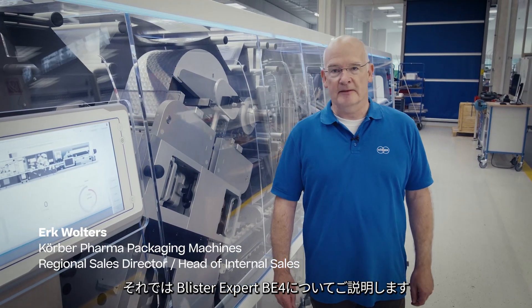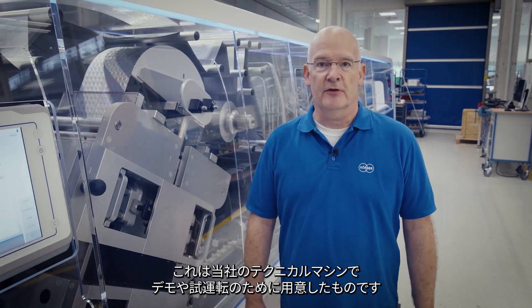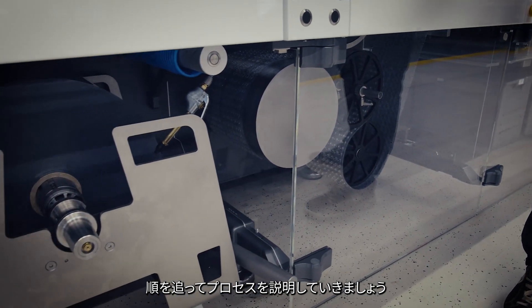I have now the pleasure to explain the Blister Expert BE4. This is our Technicum machine which we have here for demo runs and trial work, and I would like to explain the process by walking through from A to Z.